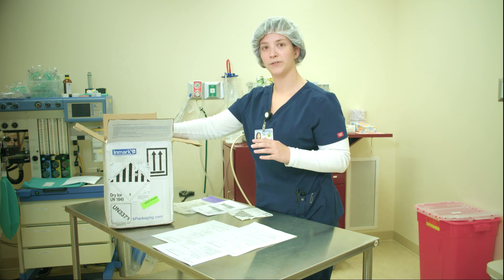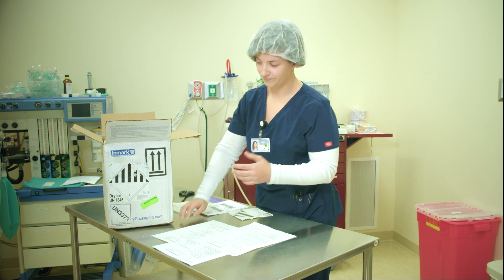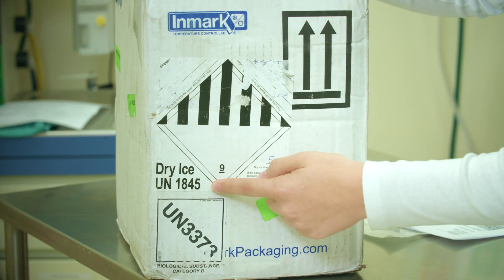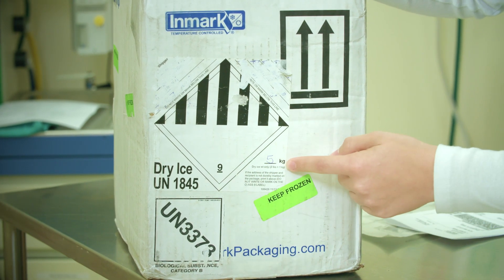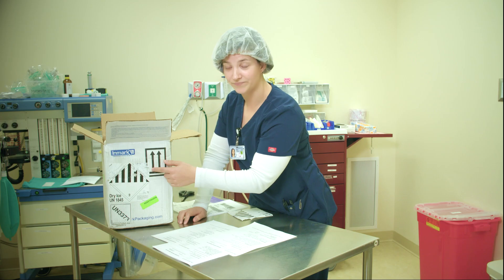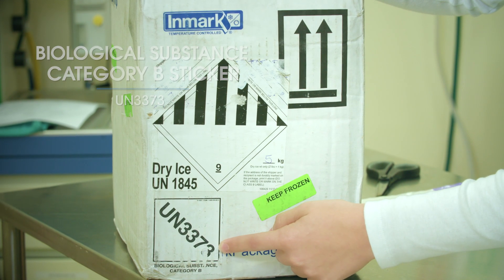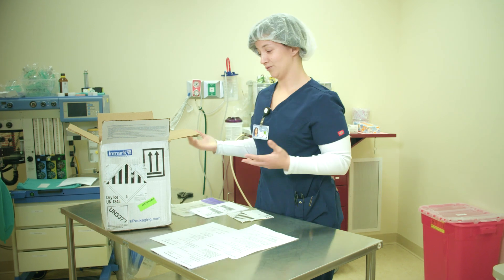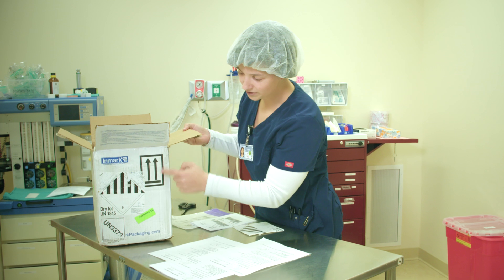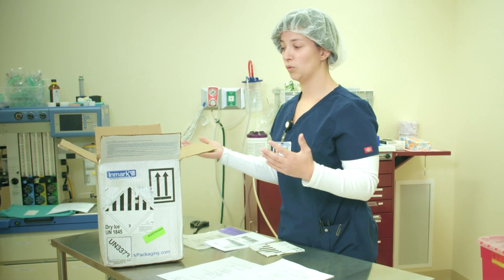Your box has to have a couple different types of stickers on it to travel with a biohazardous substance. First, you want to make sure you have the dry ice UN 1845 sticker. On this sticker, indicate how many kilograms of dry ice you have, the shipper, and where it's going. You also need a UN 3373 Biological Substance Category B sticker, which tells whoever's carrying it that there's a biohazardous substance in the box. You also need up arrows, letting the courier and the receiver know which side is up.